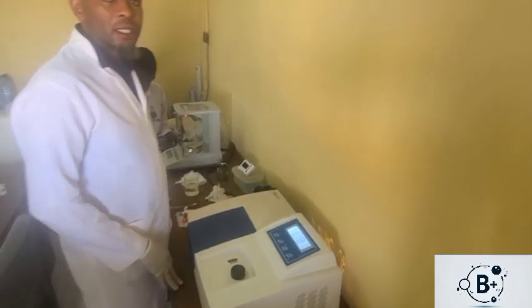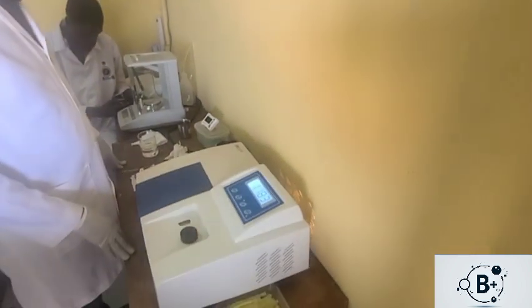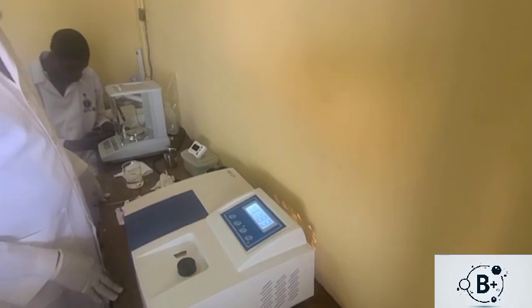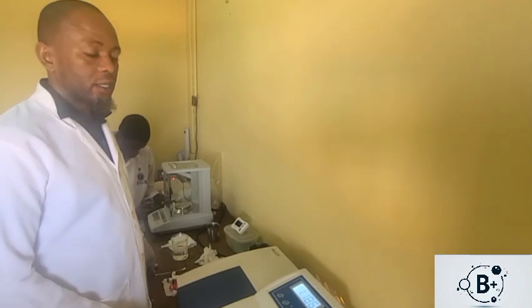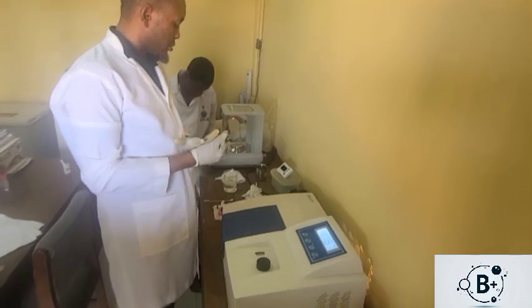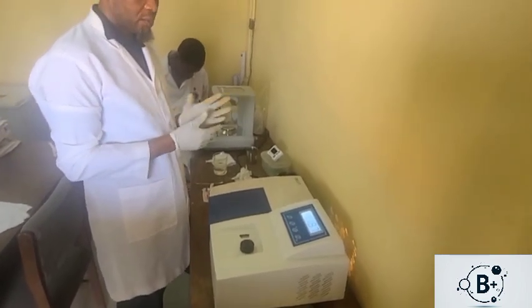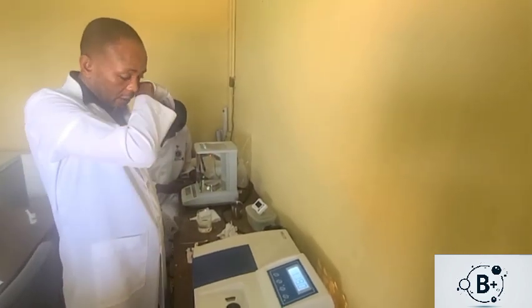On this particular assay, we are looking at the concentration against the absorbance. So we'll be considering that using a standard curve that has already been predetermined before. Then we look at that after the initial calculation.